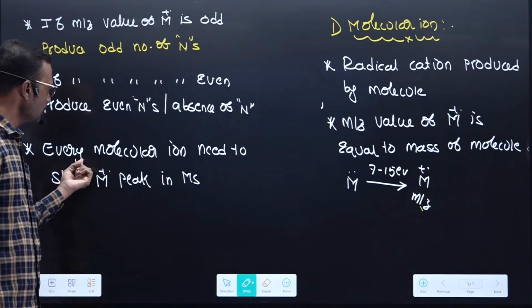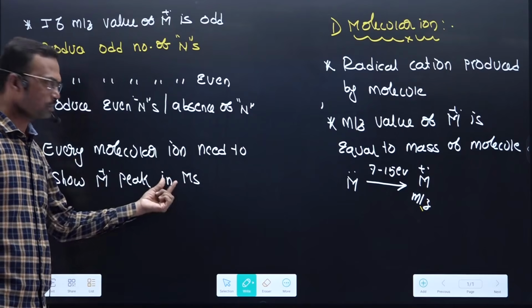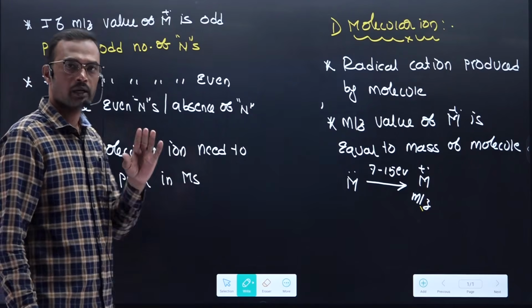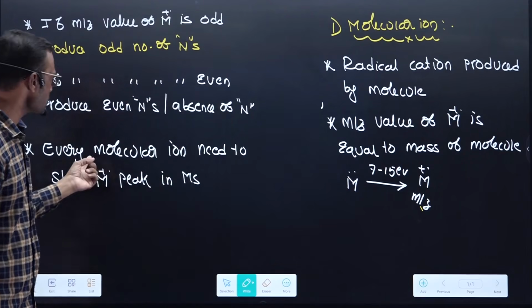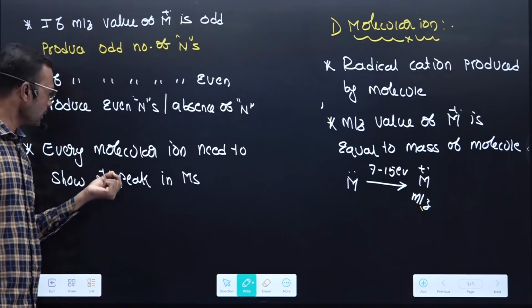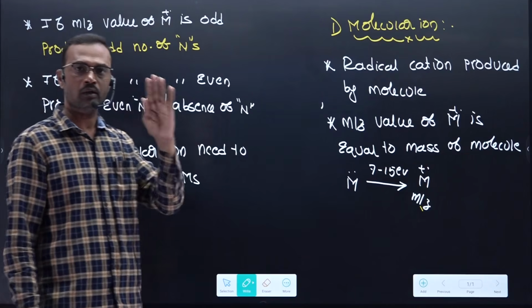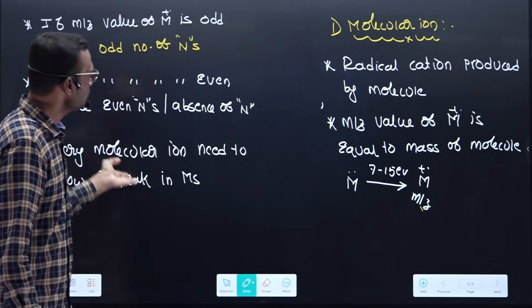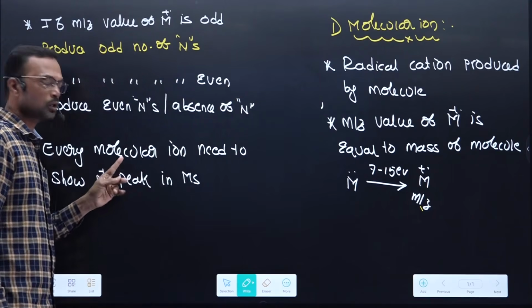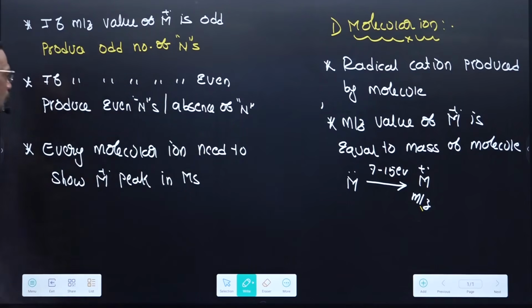Because most organic molecular ions are found to be stable, we represent them in the form of intensity, so this statement is applicable only for organic molecules. But remember, 100% certainty that a molecular ion shows its peak is not possible, though more than 90% of molecules have a tendency to show it in mass spectrometry.